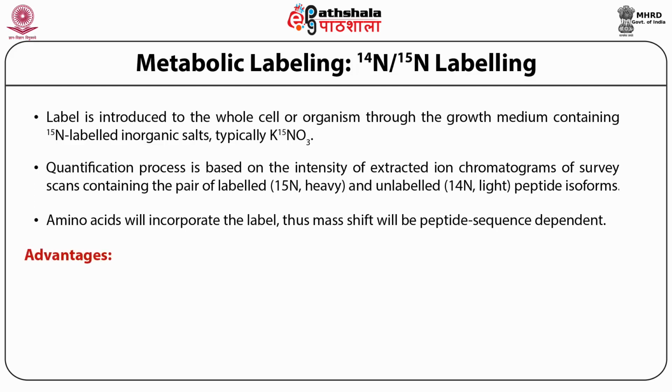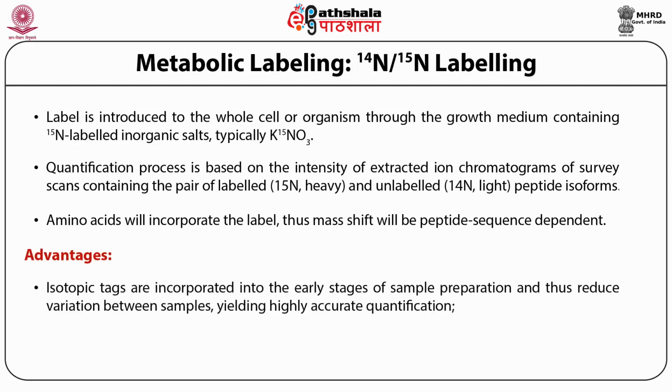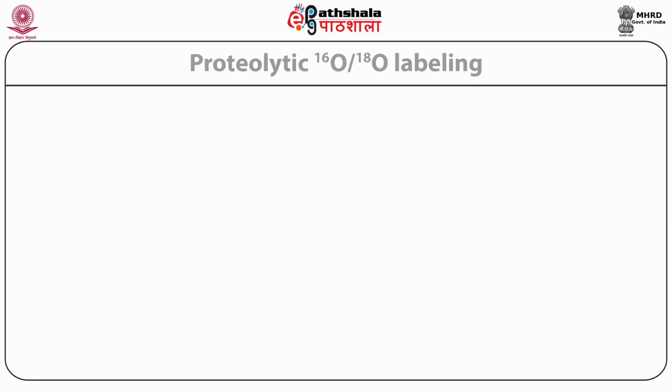The advantages are that the isotopic tags are incorporated in the early stages of sample preparation and thus reduce variation between samples, yielding highly accurate quantification, and this also allows large-scale quantitative analysis.